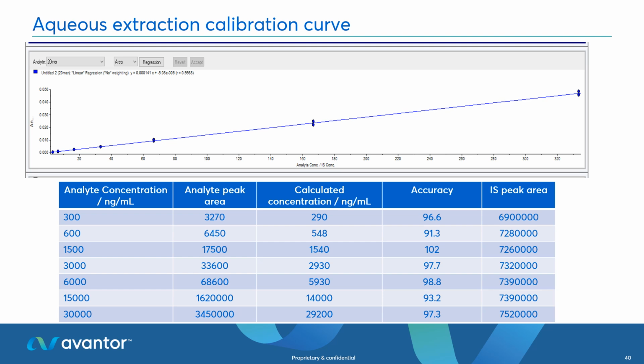The approach that we've taken is such that it could be applied to other molecules, with the idea that we've highlighted critical parameters such as the concentration of the final elution solvent with regard to the ion pairing reagent, in this case TEA, also the number of aliquots of elution solvent that is applied, and ensuring that we have the right mobile phase.